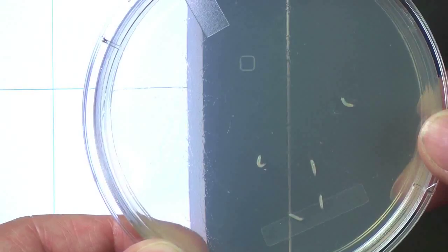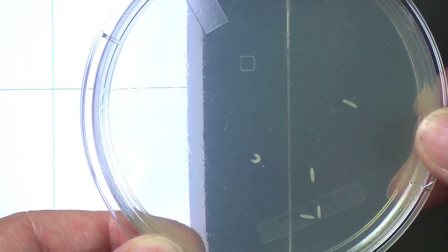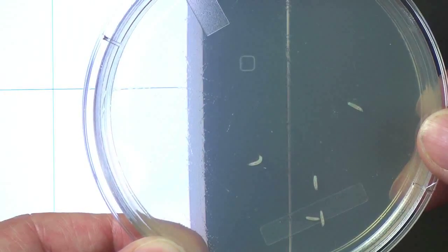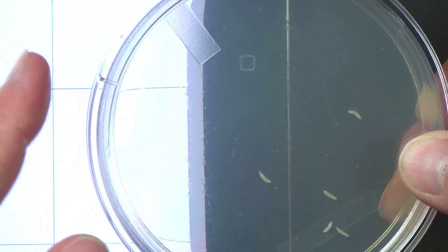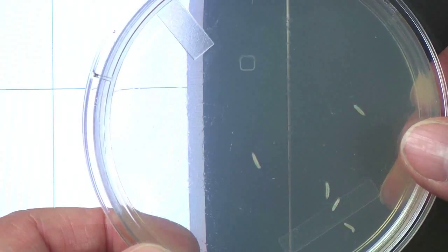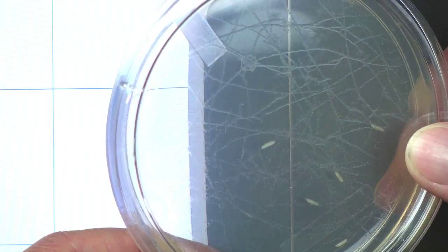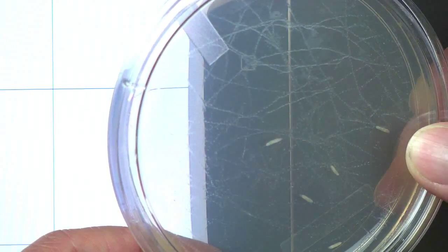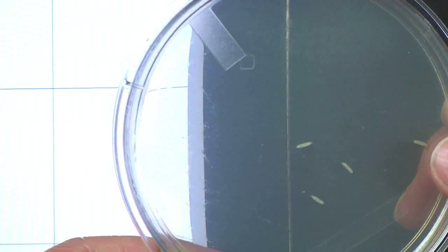You can put acid on one side, water on the other, and you can actually even carve out a little bit of the agar if you want it to stay in one spot. Then you put the larvae in the middle, and you see which side they go toward. These have really made some nice patterns, you can see them all over the agar there.